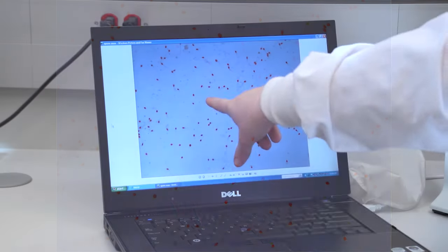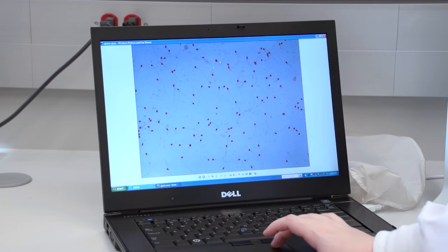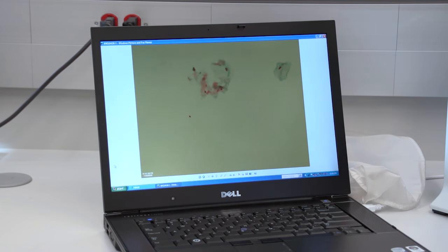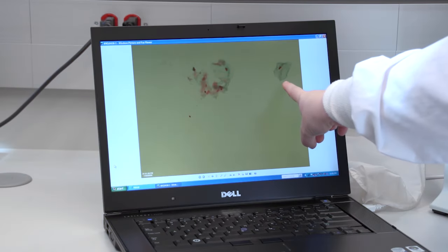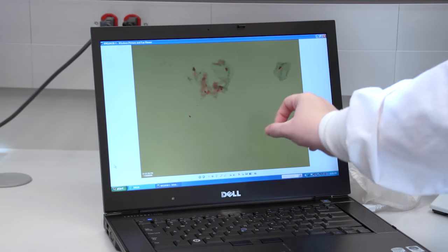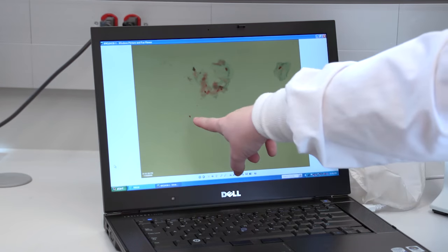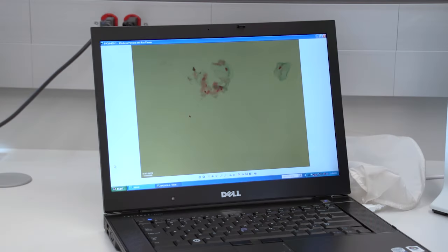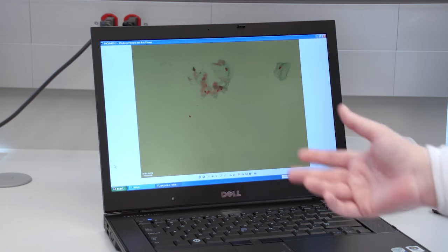There are some times when we might see nothing and then just one sperm cell and that's it. Here is another example of what we might see when you have skin cells mixed with sperm cells - something we would see on a swab from a rape kit taken from a female's body that also has sperm cells on it. This cell right here is what we call an epithelial cell - a skin cell. Here you've got the green staining with a red nucleus, which is just a normal skin cell whose nucleus is much larger than a sperm would be. And then here, there, and there are three sperm on this slide as well. So we have a few epithelial cells and three sperm. Not only do we have sperm, but we also have some kind of skin cells - we don't know who they came from - and then we would bring that on to DNA testing.